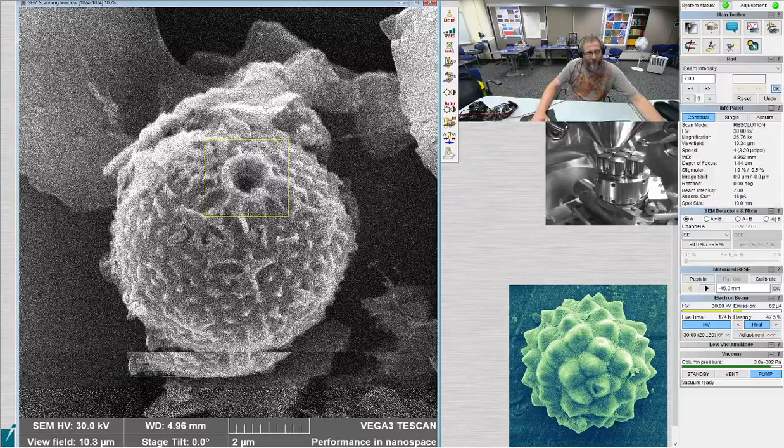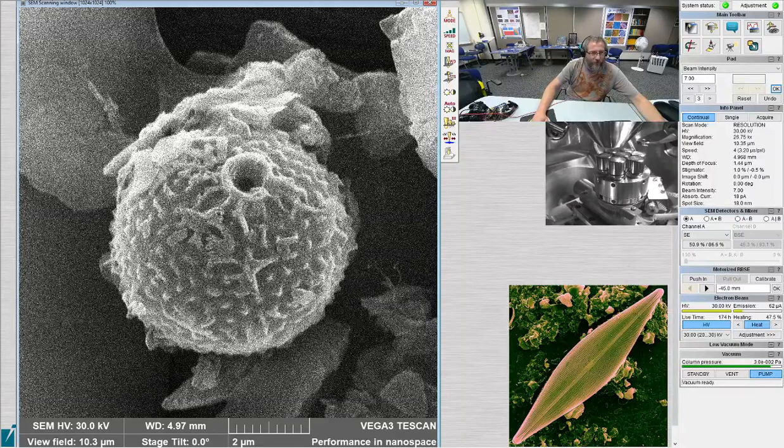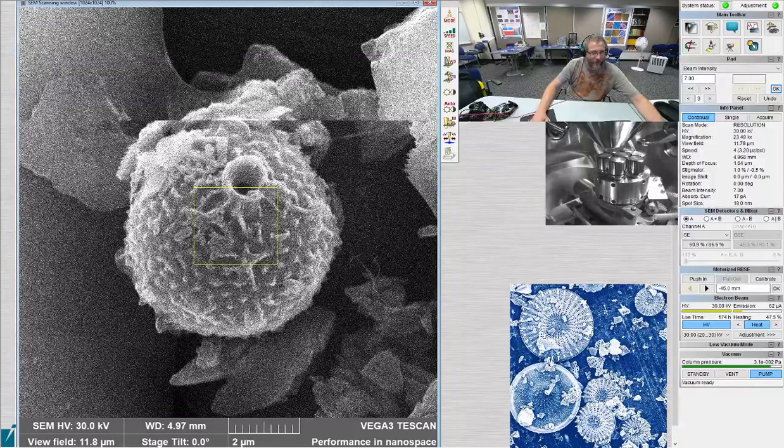But I could look them up and see. That would be fun. So this is the opening the organism comes out of, emerges from when it's done hibernating, basically. It's not hibernation, but similar.